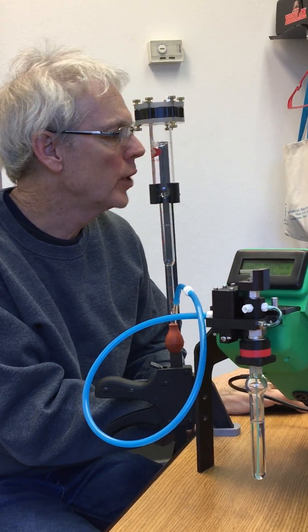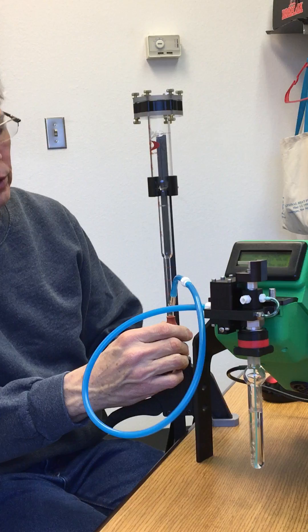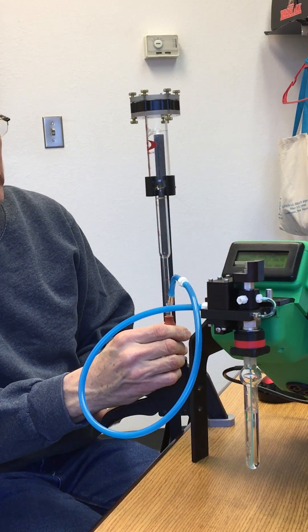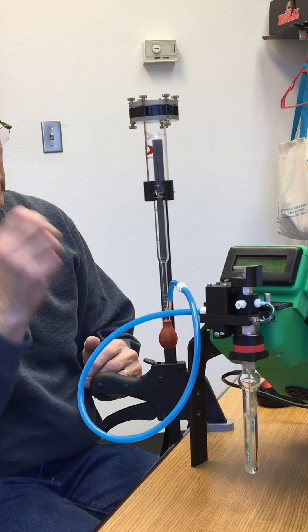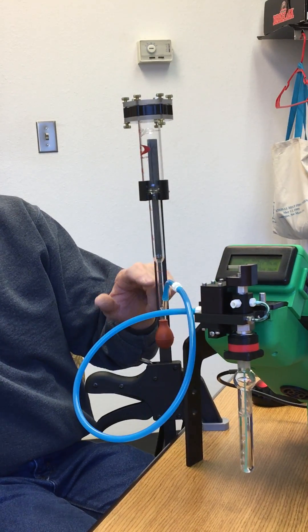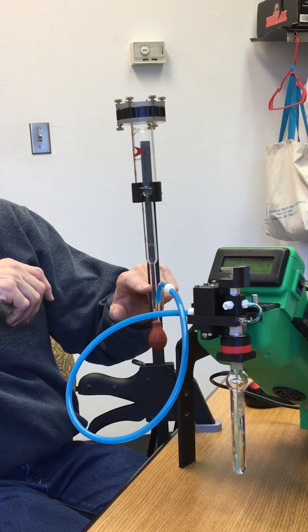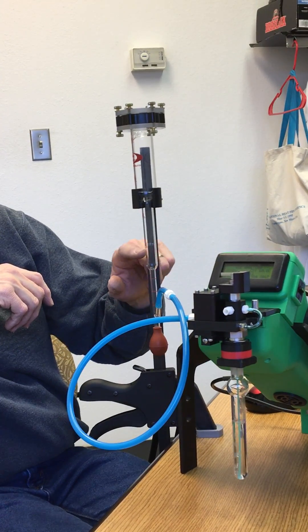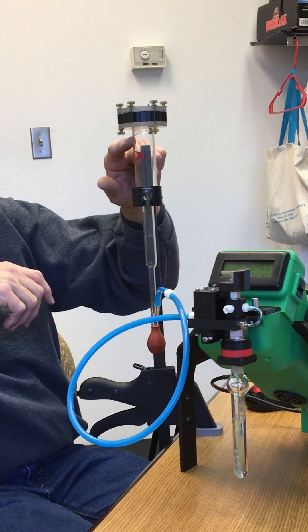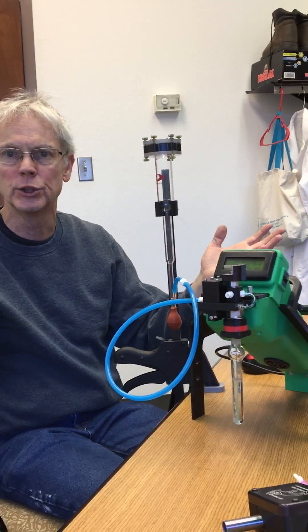I'll set it up here to where it's doing the sparge, so you can see the sparge bubbles here. A bubble will come up through it, and you use a stopwatch to measure when it travels from 0 to 10 milliliters. The meter is marked at 0, half a milliliter, 1 milliliter, 5 milliliters, 10 milliliters, all the way up to 50 milliliters, allowing you to measure over a wide range of flow rates.